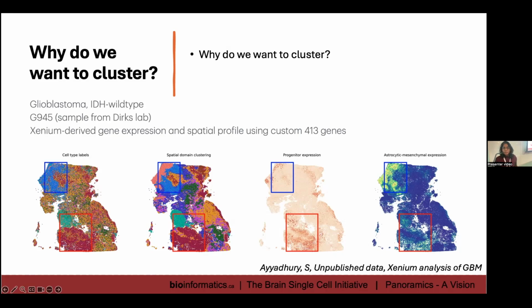I can definitely tell you that not all disease tissues actually have spatial domains. It also depends on the region from which you are cutting or taking your tissues. So whether you find a domain or a non-domain, just non-spatial clustering, it really depends on where you're interrogating it from. It's not as simple as just passing it through an algorithm.